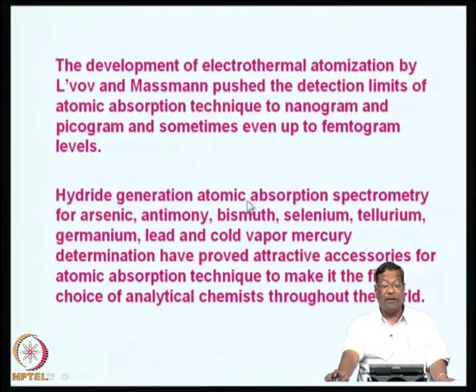So, hydride generation atomic absorption spectrometry is useful for the analysis of arsenic, antimony, bismuth, selenium, tellurium, germanium, lead, etc. These are 6 or 7 elements which form hydrides, and this technique permits the determination of picogram levels of these elements, and mercury also to some extent.